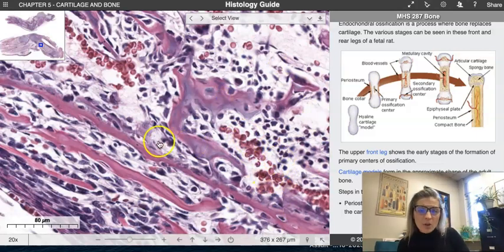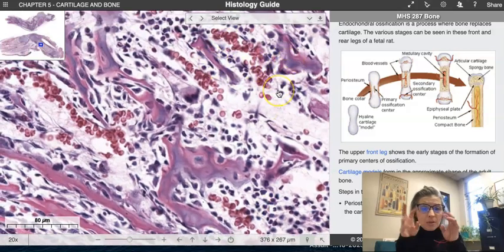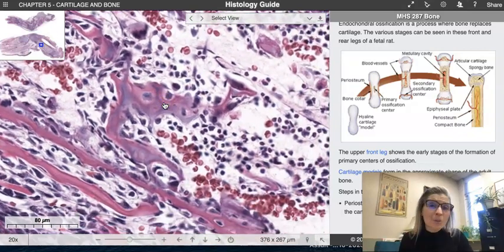And then I get that question of, well, what are these big pink strand things? Those are actually trabeculae. We start to form little bony spicules, and then they start to fuse into bigger ones that essentially become the trabeculae. So you have trabecular bone or spongy bone forming here that will be remodeled into compact. All right, so we're not in that stage of development.